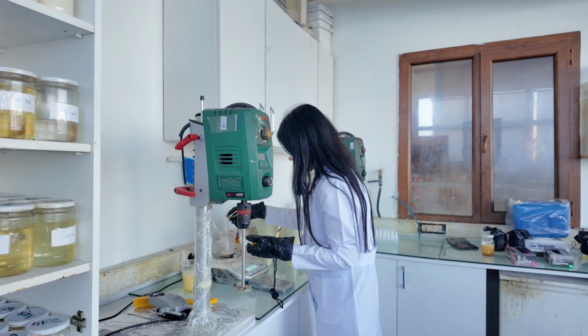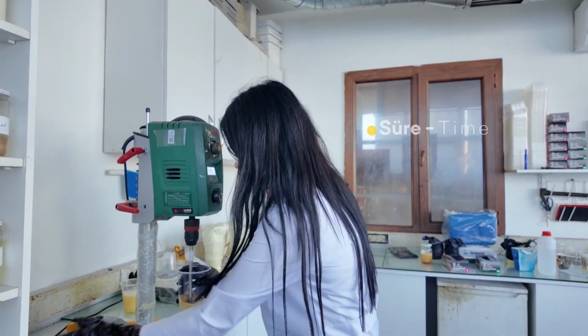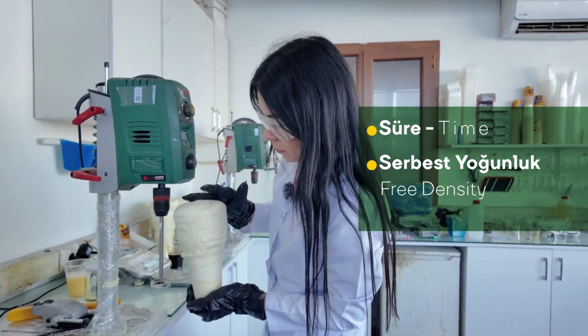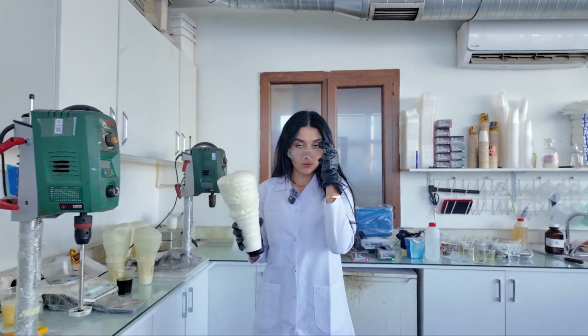We are about to watch the casting of the closed cell that passed the ASTM E84 test for America. The key parameters for us are time. If these are okay, we will go down to our quality laboratory and check the physical parameters of the liquid sample. After it cools a bit, we will check its free density.